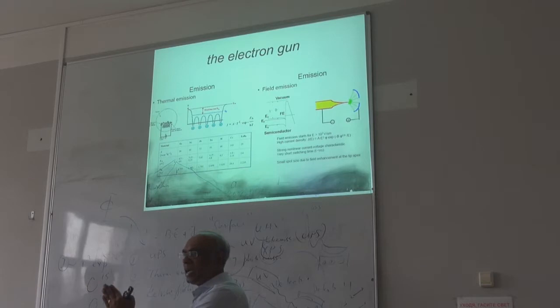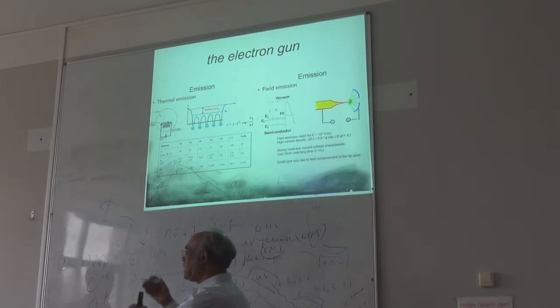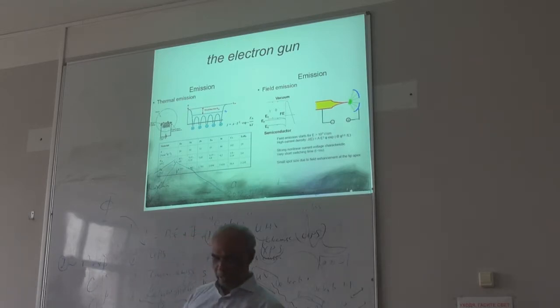When you make this contact, what will happen? They will try to equilibrate, and you get the same potential. Then you can look at something called the offset voltage. Basically you are measuring the voltage across these two. By doing that, you can get the Fermi energy. That's called the Kelvin probe. Maybe next time I'll talk about that.